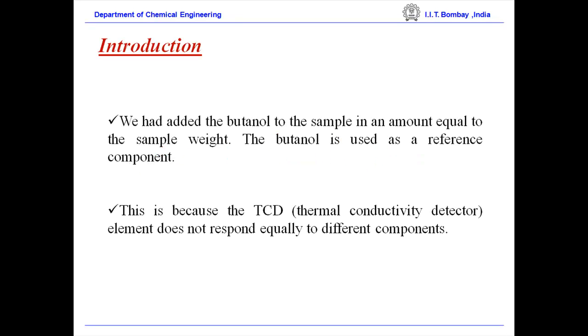We had added the butanol to the sample in an amount equal to the sample weight. The butanol is used as a reference component. This is because the thermal conductivity detector element does not respond equally to different components.